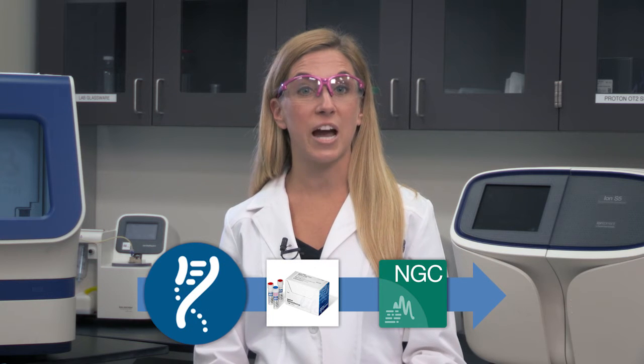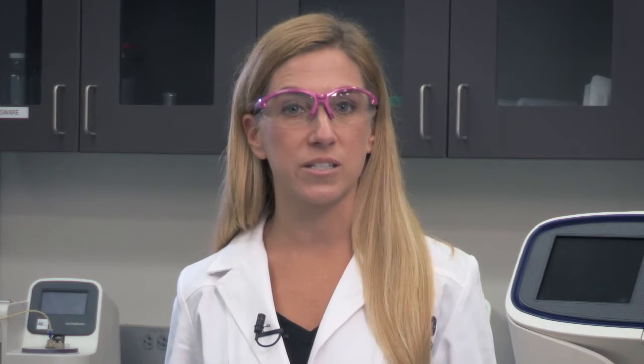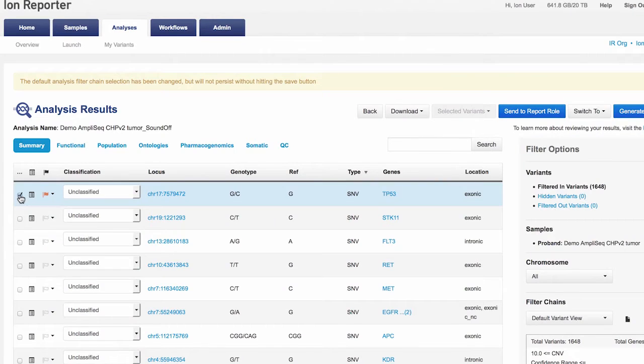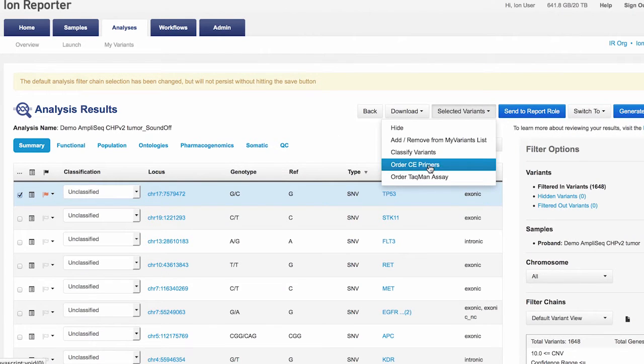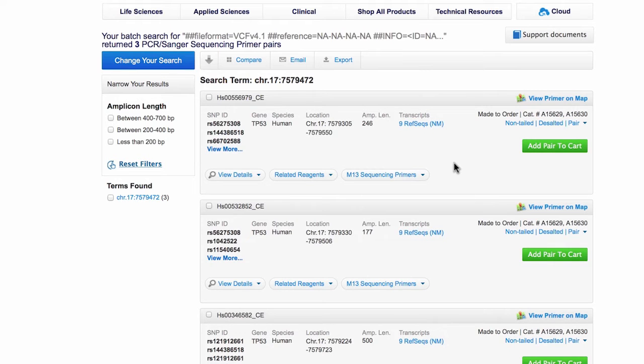The first thing to do is to find the correct primers for your re-sequencing reactions, and this has become an easy task thanks to the Primer Designer tool, which we reviewed in a previous Seek It Out segment. If you are using an Ion Torrent system, you can access this tool easily through Ion Reporter — just check your variants of interest and select Order CE Primers from the top button.